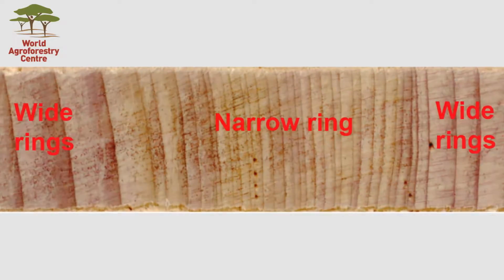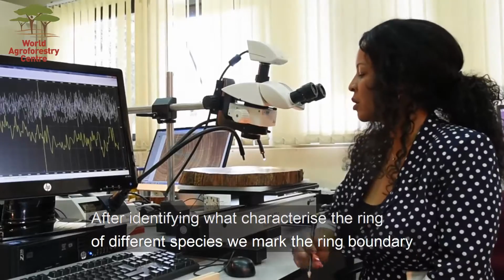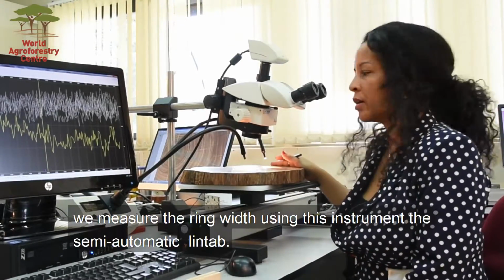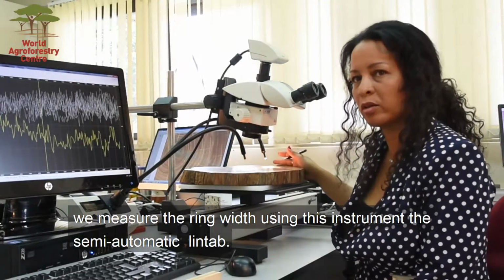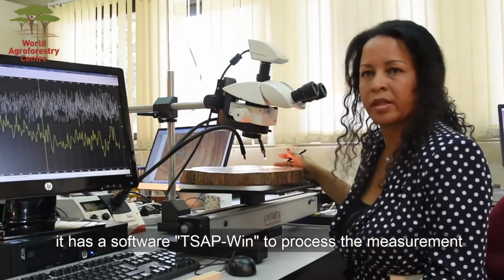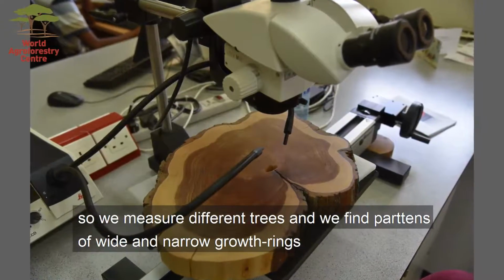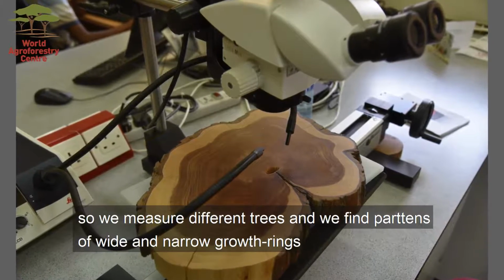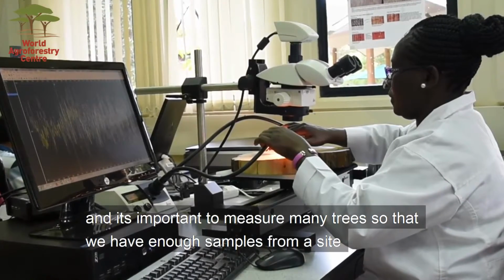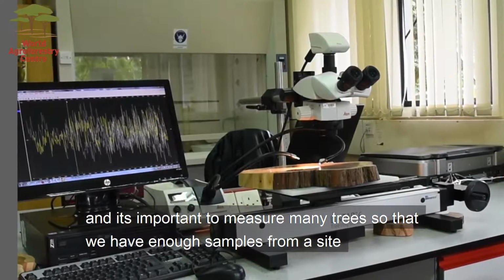After identifying what characterizes the ring of different species, we mark the ring boundary and we measure the ring widths using this instrument. It's a semi-automatic Lintab. It has the software TSAP to process the measurements. So we measure different trees and we find patterns of wide and narrow growth rings. It's important to measure many trees so that we have enough samples from a site.